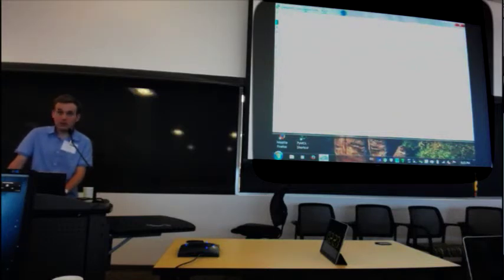And then the command to create the HKL file from this stream is at the bottom. It's this one, process HKL. It takes as an input the stream file and spits out the HKL file.